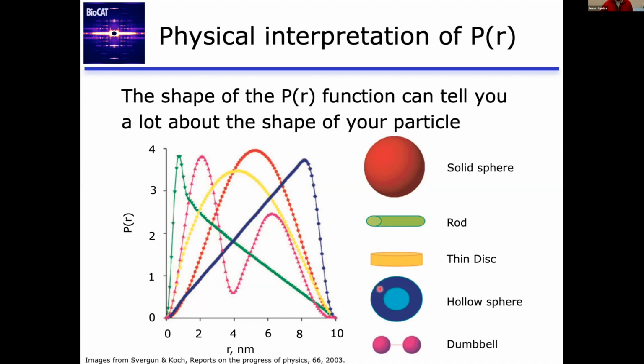You have some short distances in here, but you have a lot of longer distances across, all the way across the center of the sphere. So it peaks near the maximum dimension, near this outer shell distance, basically.